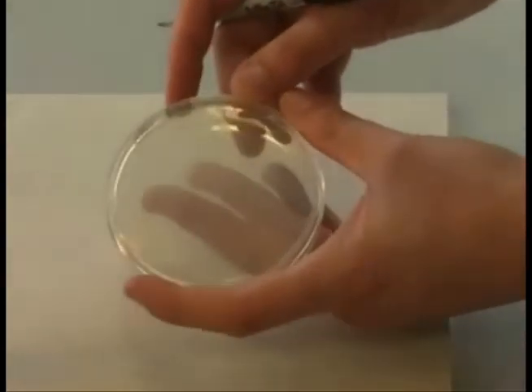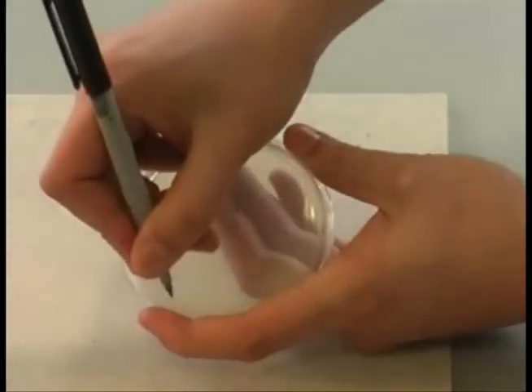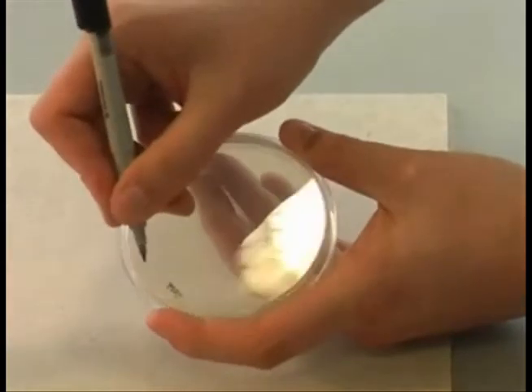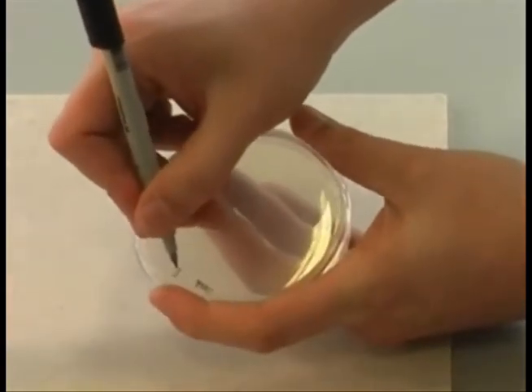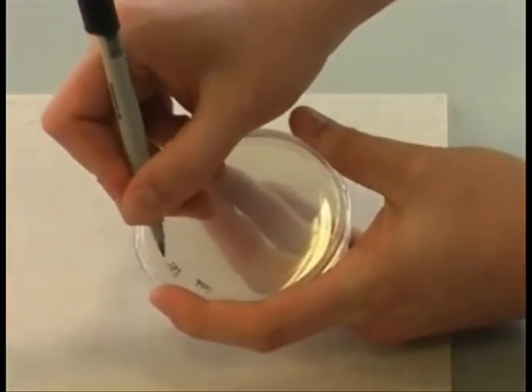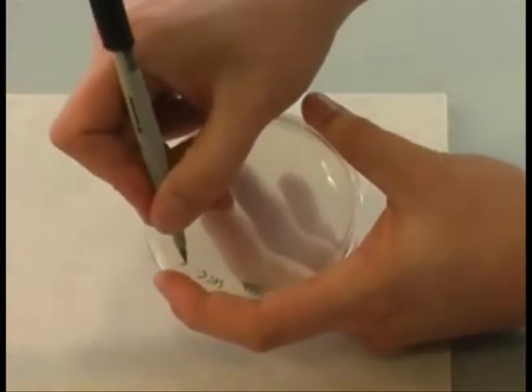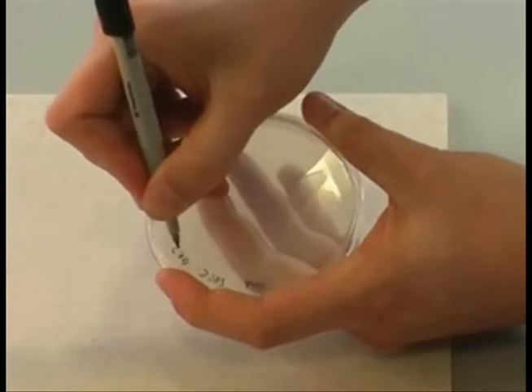It is vital that you appropriately label all plates you are working with in a suitable manner. Use a marker pen to label the base of each plate. The base is the half of the plate that contains the agar. You should avoid labelling the lid of the plate as this does not help identifying the organism if the lid falls off.